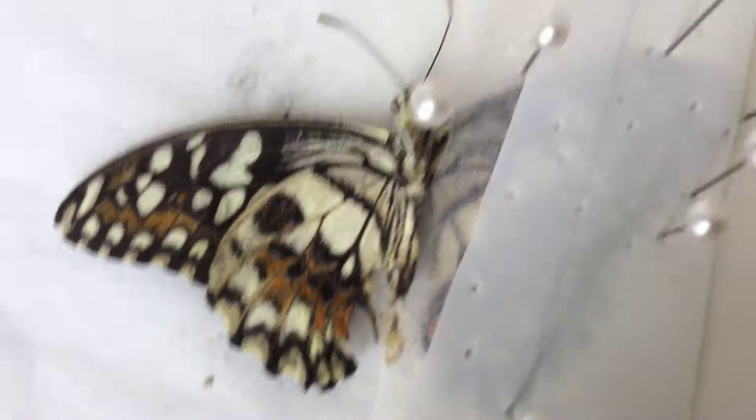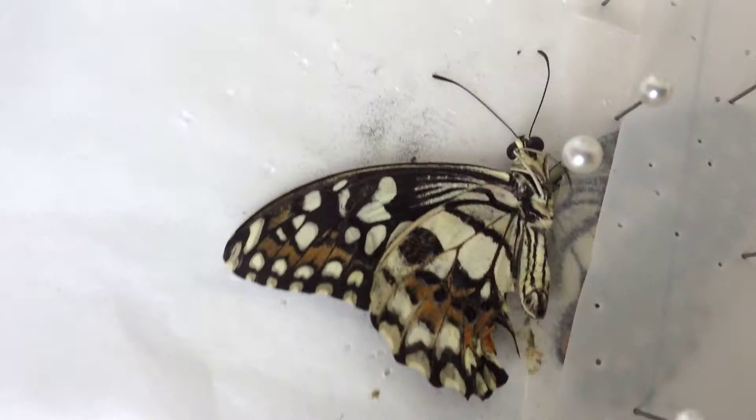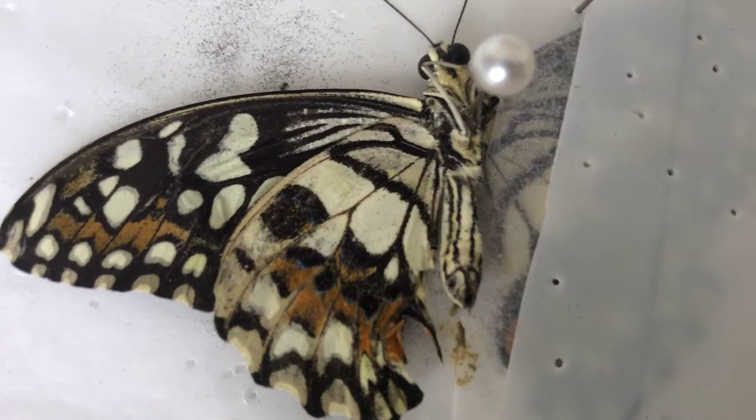Hey guys, this is Michael from MichaelTubeHD. Right now you're not staring at my handsome photos, but you're staring at a live butterfly specimen, because we're going to be mounting the specimens.